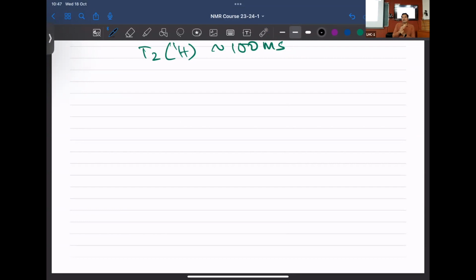Okay, let me move on. Last 10 minutes available. As much as we are doing very important stuff in the last 10 minutes of every class, today's class is also going to be like it. Take a look at this pulse program called HSQC and come tomorrow. We'll revise again like the way I did today. Today morning, I repeated HMQC. Tomorrow morning, I'll repeat HSQC. But let's get something started so that you guys start thinking.